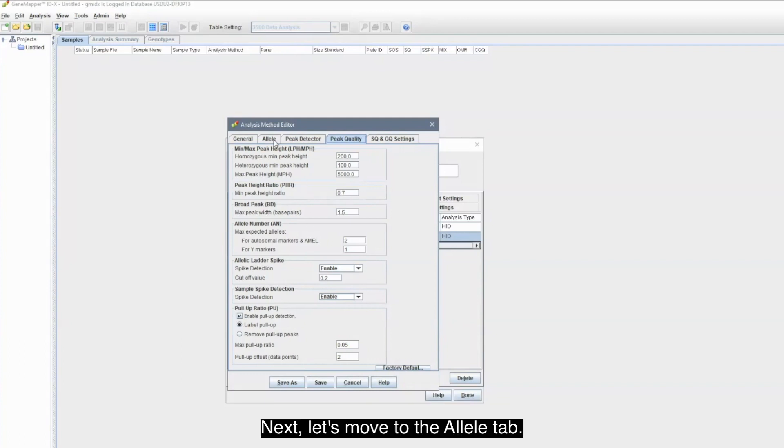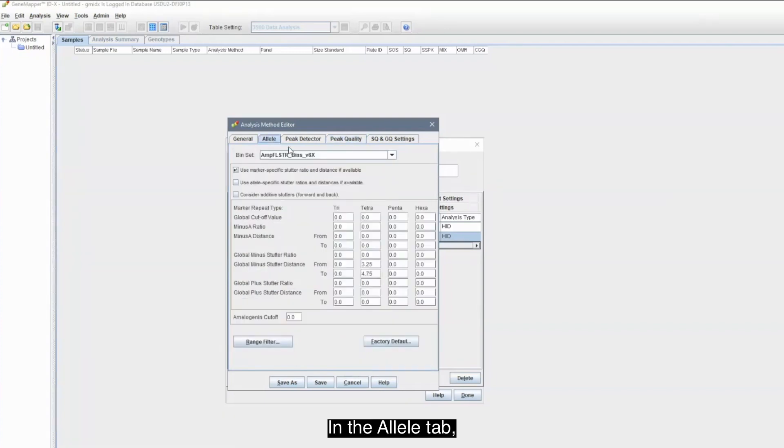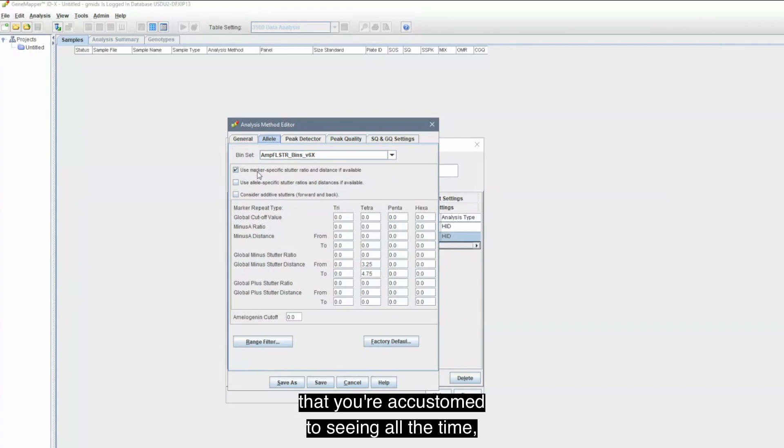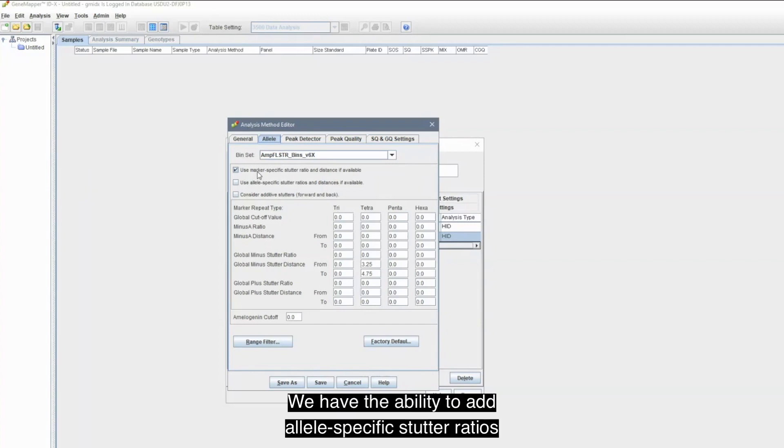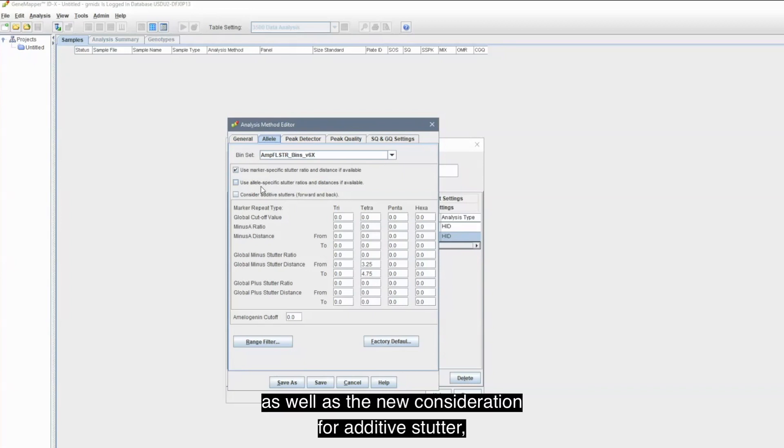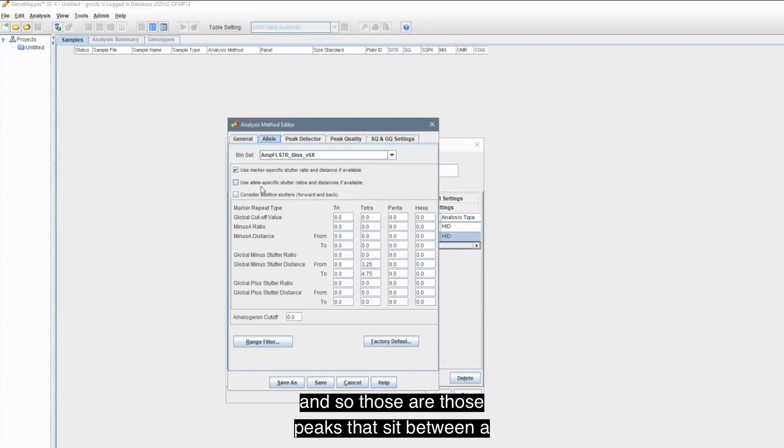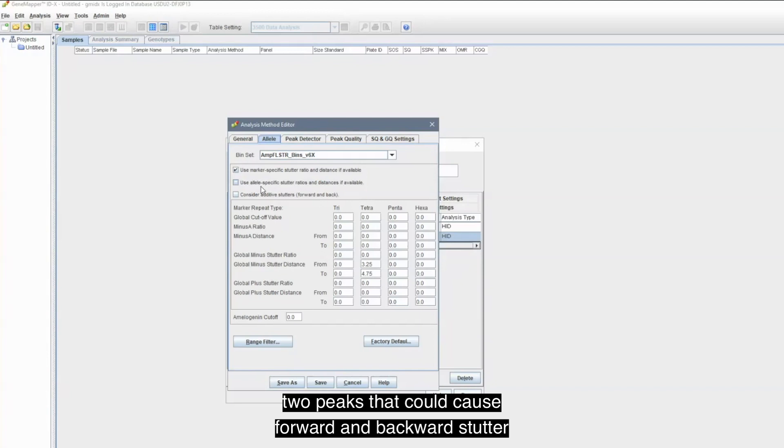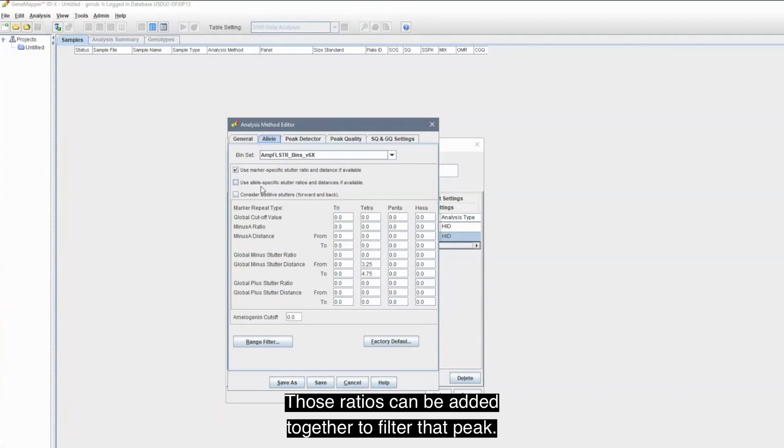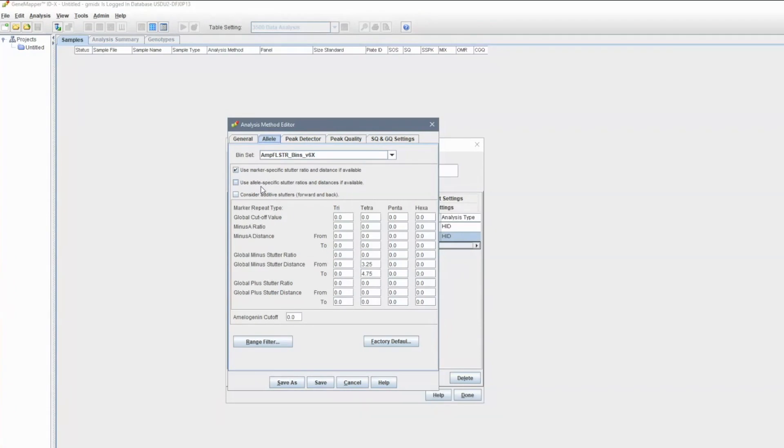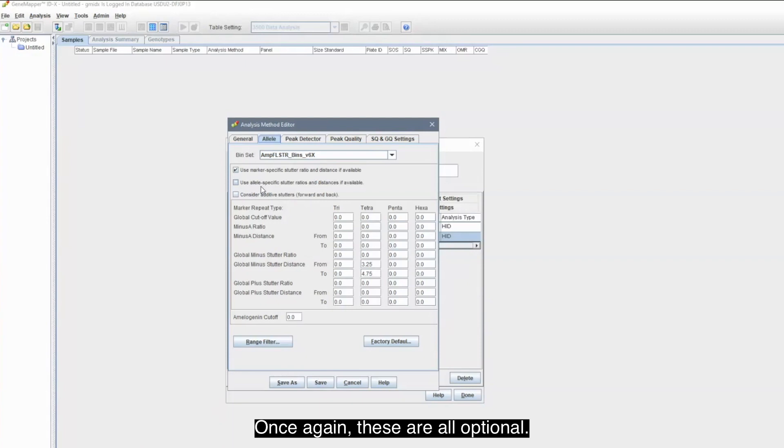Next, let's move to the Allele tab. In the Allele tab, you'll see the marker-specific stutter ratio that you're accustomed to seeing all the time. But below that, we have two new settings. We have the ability to add allele-specific stutter ratios, as well as the new consideration for additive stutter. Those are the peaks that sit between two peaks that could cause forward and backward stutter that could then be added. Those ratios can be added together to filter that peak. Once again, these are all optional.